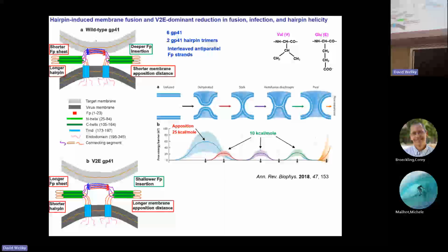So what Matt and other individuals in our group did was to chemically synthesize the fusion peptide and put isotopic labels wherever you want. You can have a minimal number of labels, and you can make the rest of the protein by expression, and then with native chemical ligation you get a full protein, but it only has limited labels. Long answer, yes, we have published in that area.